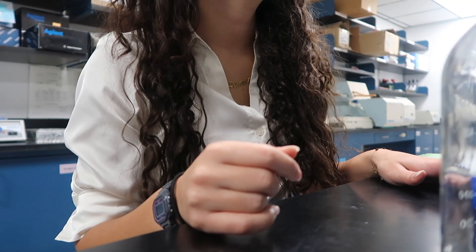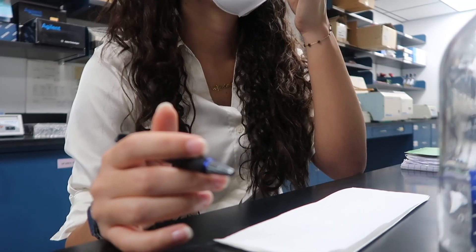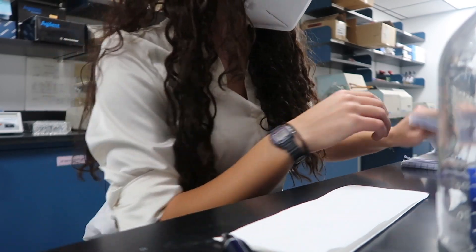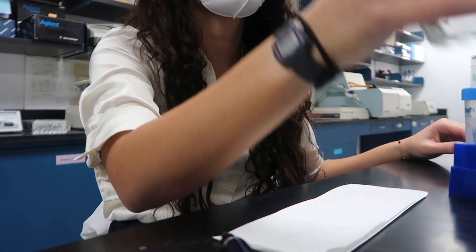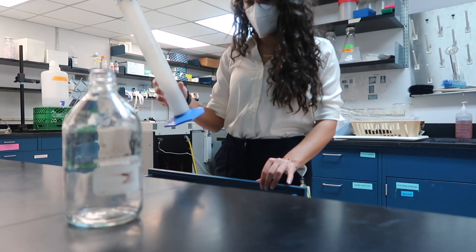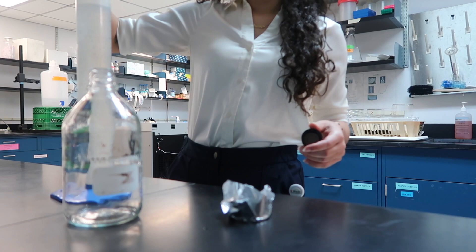Okay, 500 milliliters of PBS — so it's 500 milliliters. Let me look that up. Okay, I guess I could just eyeball this to 500. Actually, I'm going to pour it into something. Okay, this is 500 ml. Bam, 500.